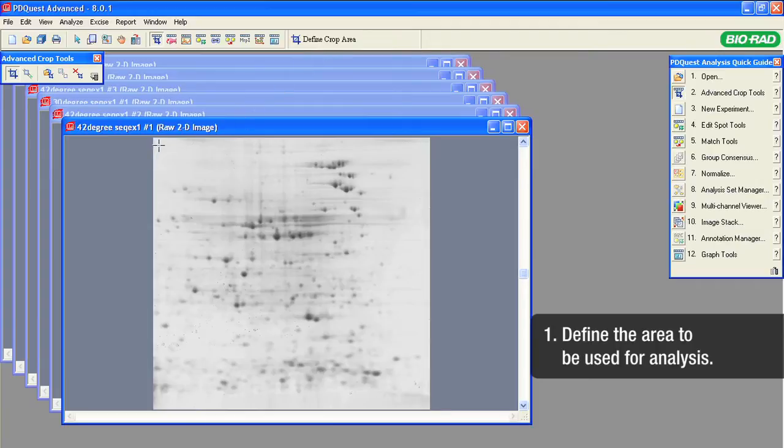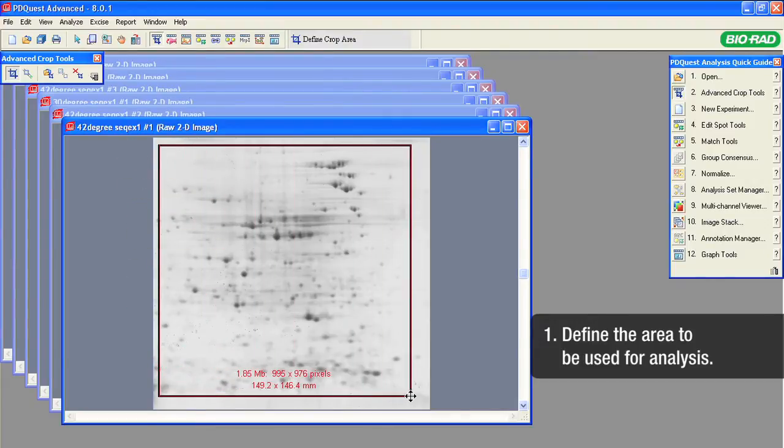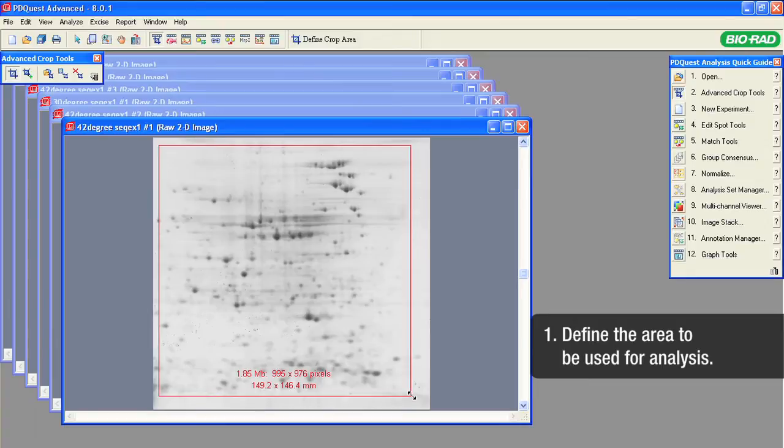Position the frame to include the area on the gel image that you want to analyze. Be sure not to crop too much and leave some image area around your spots of interest.